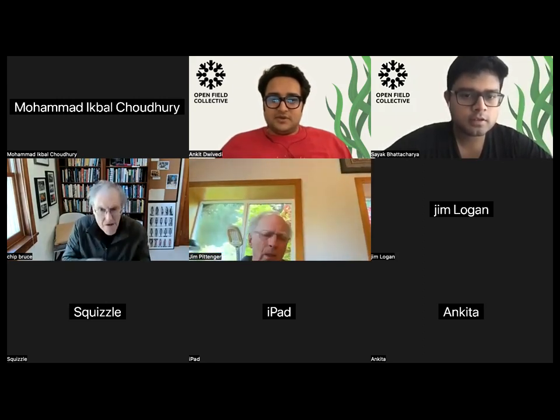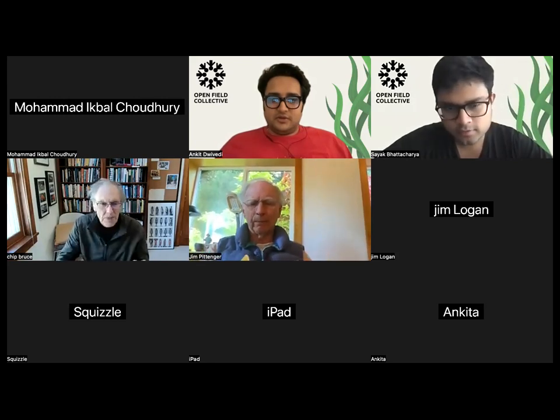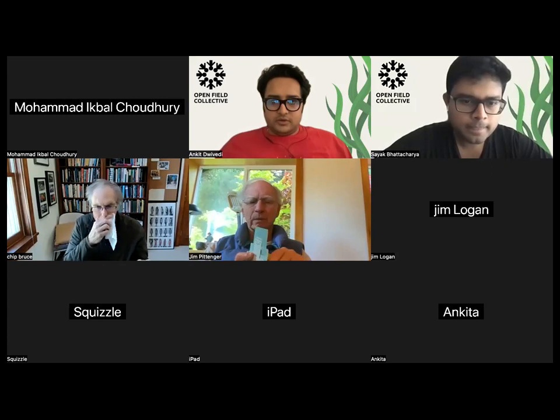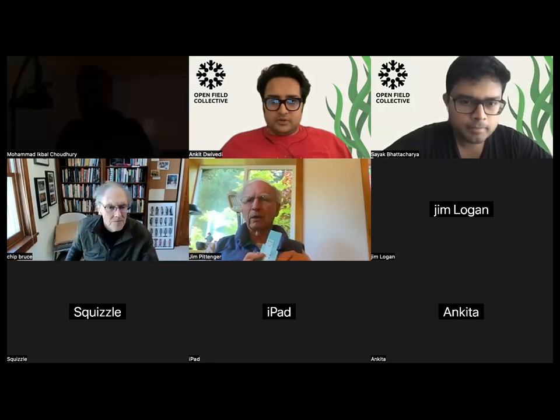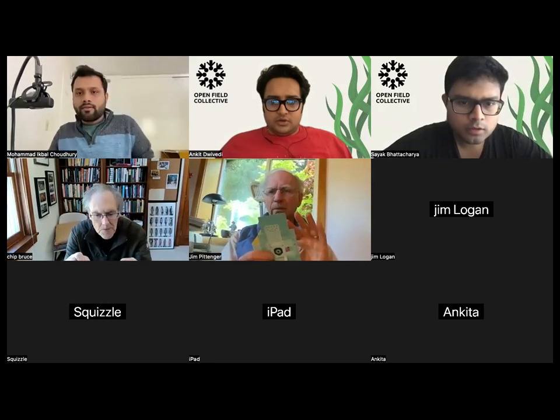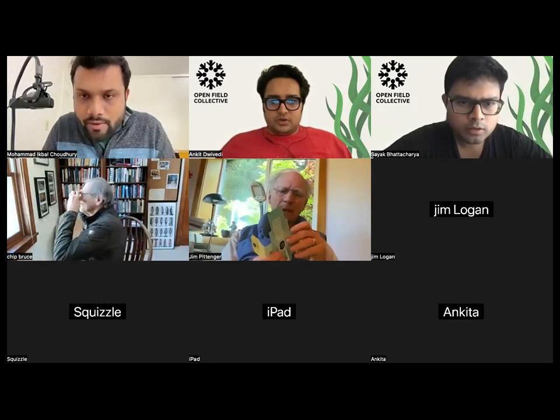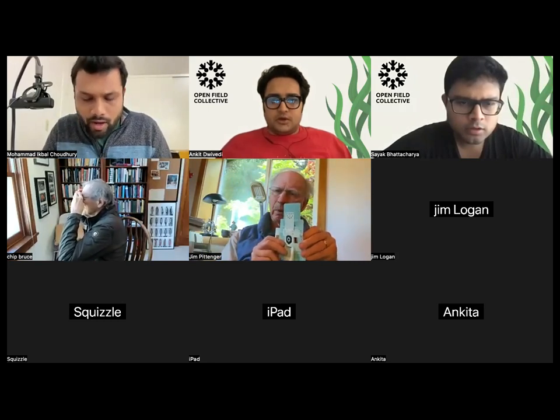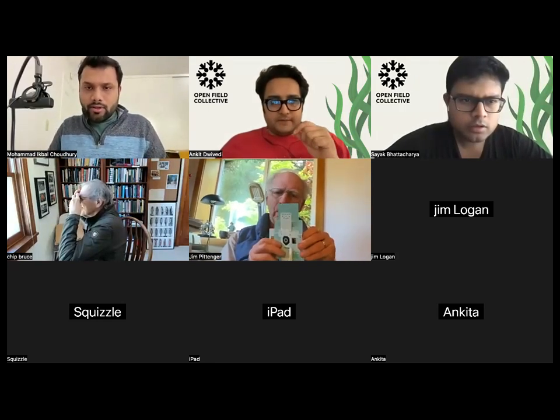Yes, I can. The problem I'm having is that little blue paper in the foldscope. It's not broken, so I can't get the slide through. So I held the slide over it, and I can see the fern. But it looks like I have to take a little knife or a razor and slit that paper. Not really, not really.